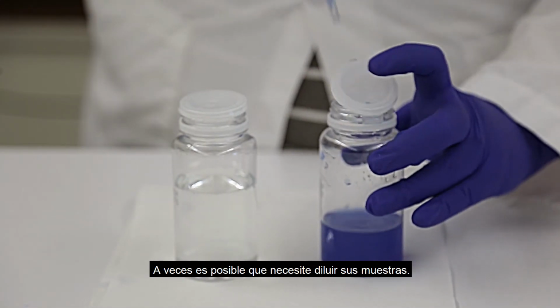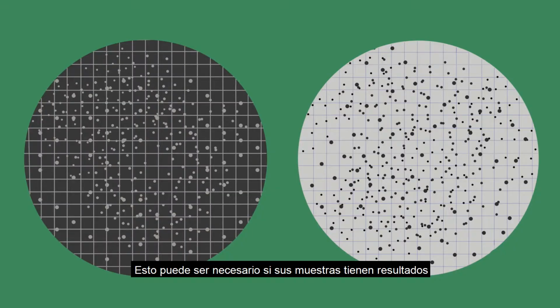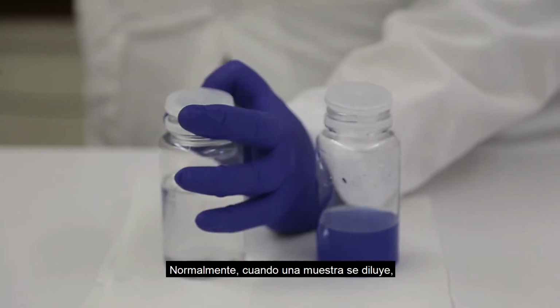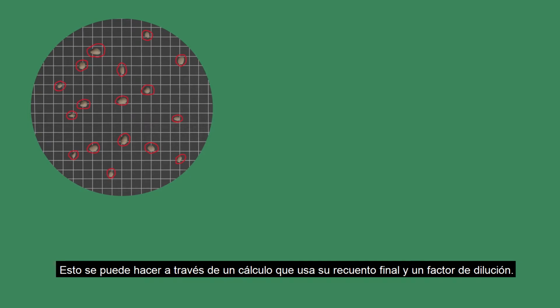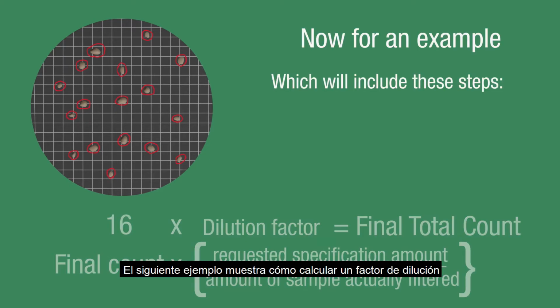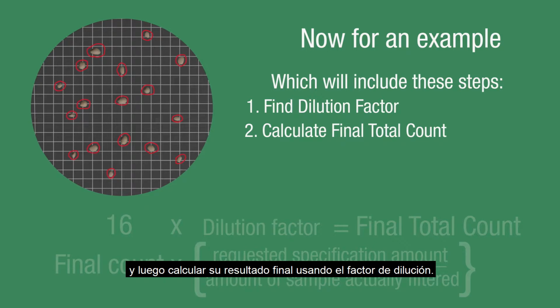At times, you may need to dilute your samples. This may be necessary if your samples have results that are too numerous to count, TNTC, or if you need to increase the filtration efficiency of your sample. Typically, when a sample is diluted, the dilution needs to be taken into account when reporting results. This can be done through a calculation that uses your final count and a dilution factor. The following example shows how to calculate a dilution factor, and then calculate your final result using the dilution factor.